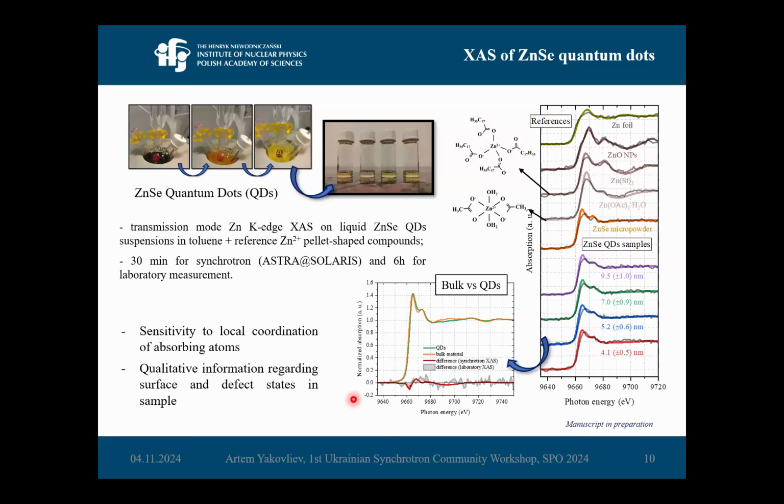And in some good cases, you can even start doing a chemical analysis of your sample, even with laboratory data. However, if you want good quality spectra and good quality analysis, of course, you would have to go to a synchrotron facility and get better spectra.